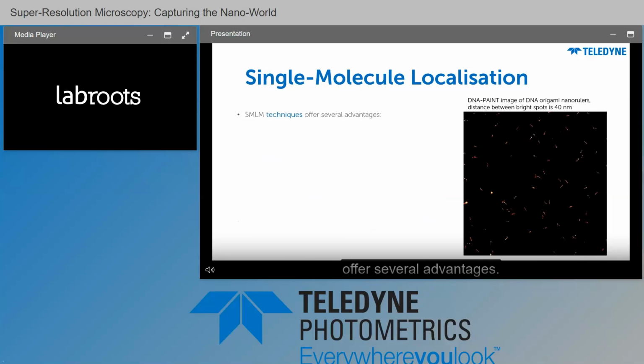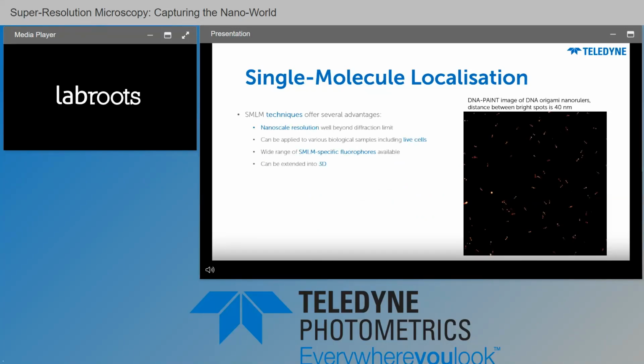Single molecule techniques offer several advantages. You get a nanoscale resolution well beyond the diffraction limit. You can apply them to various biological samples, including live cells. There are a wide range of fluorophores specifically for single molecule available, and it can be extended into 3D.